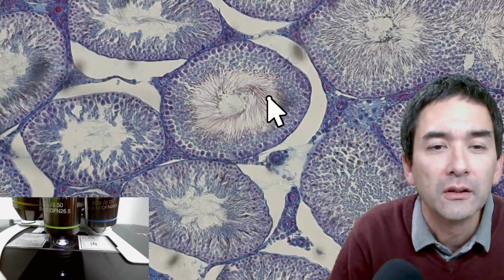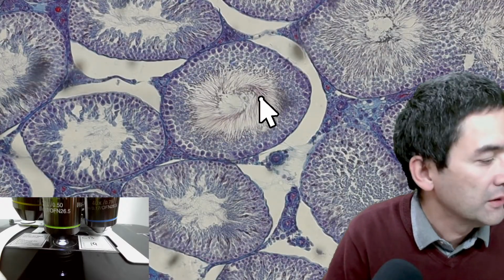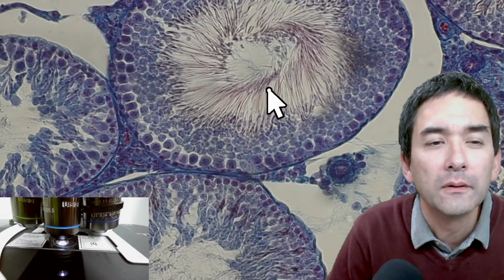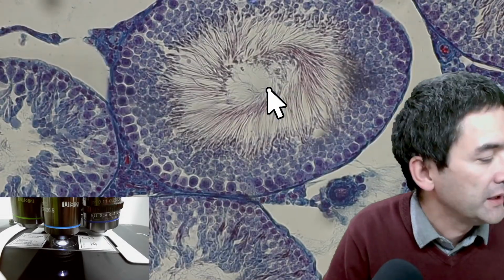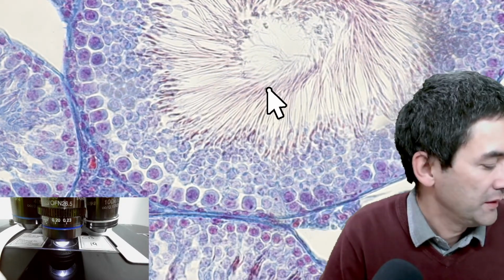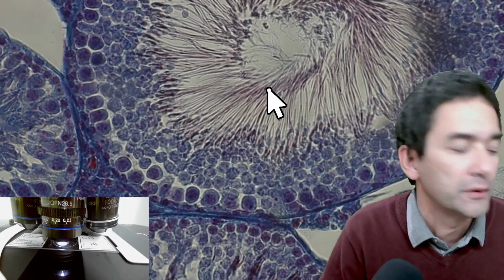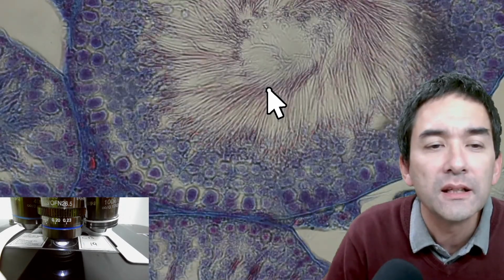Here, much nicer. Look, do you see all of those lines in here? It's much more organized here. Yeah, here, that's a nice one. Okay, that's actually really nice. Let's go up yet further. Yes, here, that's a good one. I changed the light a little bit too much. So let's focus. Yes, this is a good one.